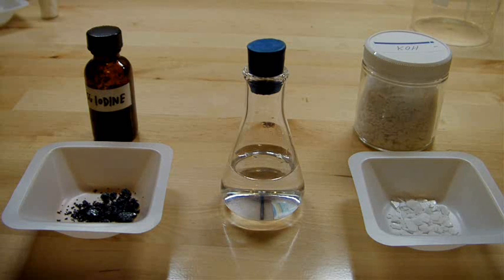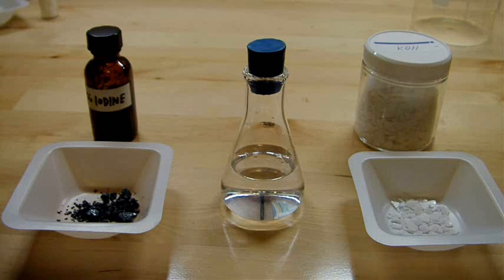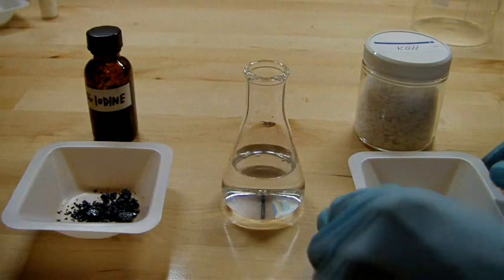On the left here I have 5 grams of iodine and on the right is 2.2 grams of potassium hydroxide, the stoichiometrically equivalent amounts. So the first thing I'm going to do is dissolve the potassium hydroxide into solution.